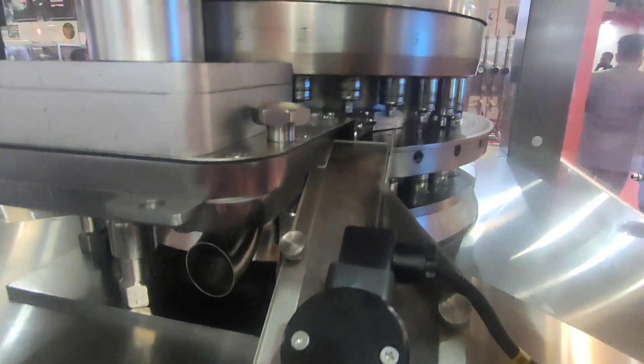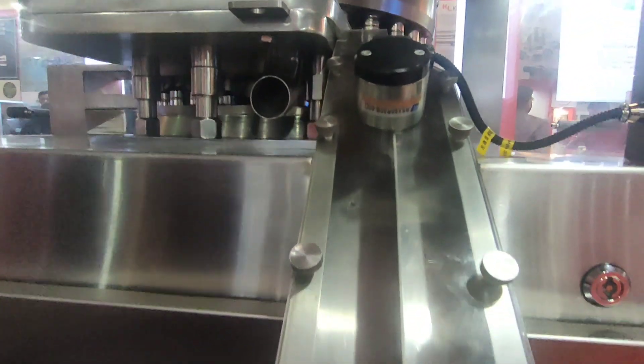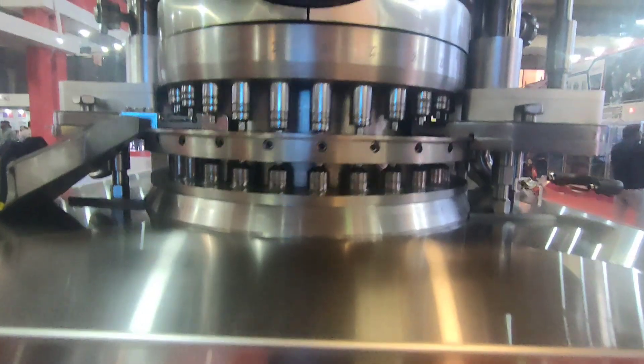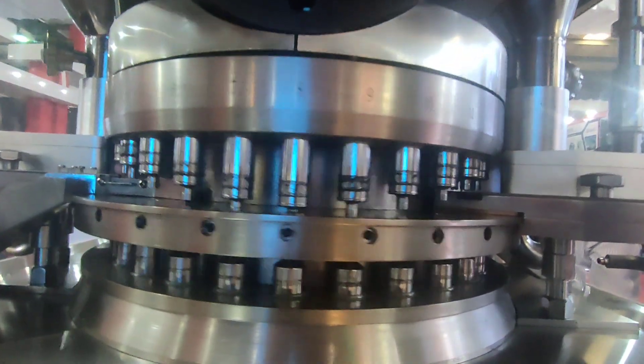Here we have the swipe blade, where tablets strike after ejection and come into the discharging chute. This one is the discharging chute, and from here we collect the tablets in the container.